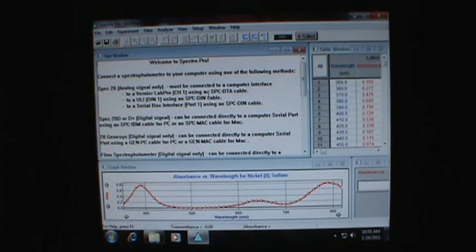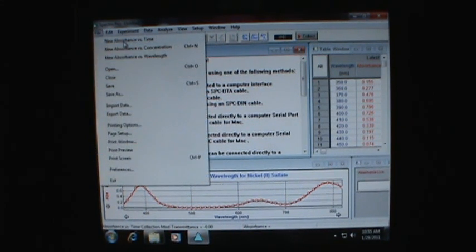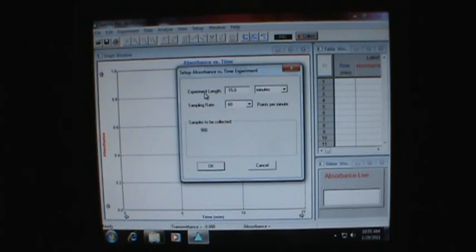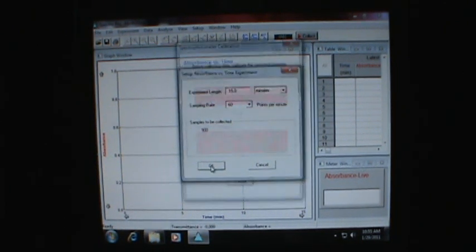This is the open page for SpectroPro. We want to set up a new absorbance versus time experiment. Read your dialog boxes. To collect data, verify the experimental setting, follow the on-screen instructions, insert sample, click collect. We'll set it up for 15 minutes. That's longer than we'll need, but 15 minutes is okay. 60 points per minute will be one per second, so that looks good.